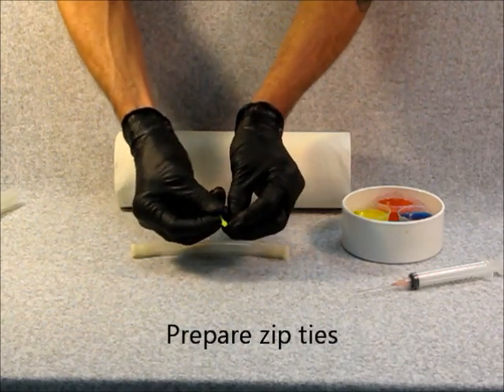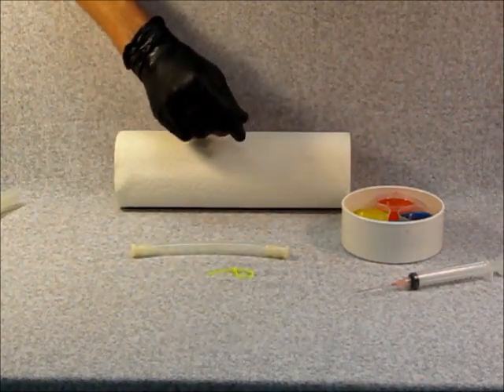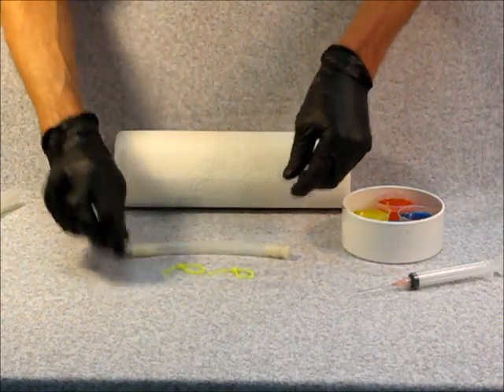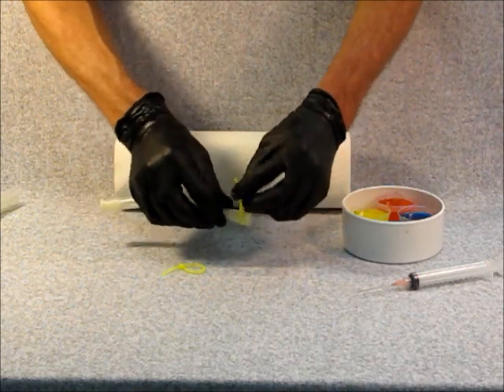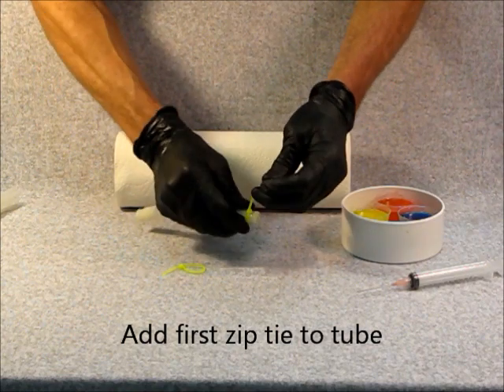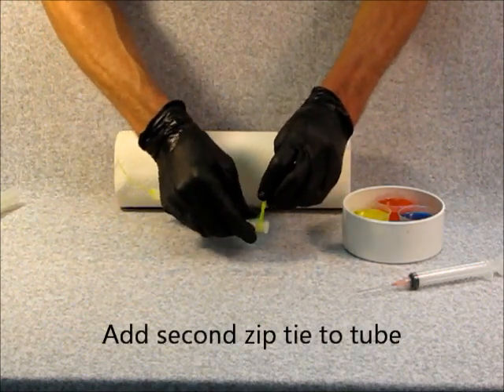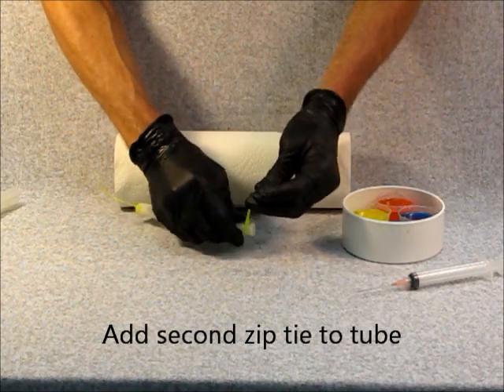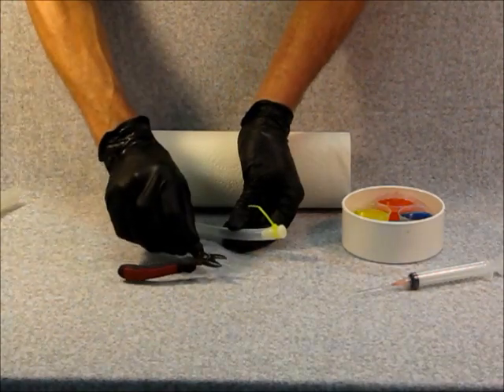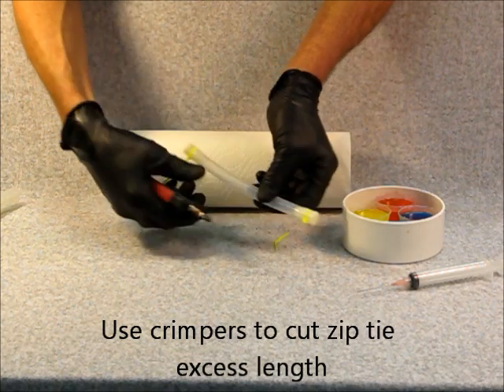Prepare your zip ties by making loops out of them. You may then add the first zip tie to the tube as shown. You may then use the crimpers to cut the zip tie excess length off as appropriate.